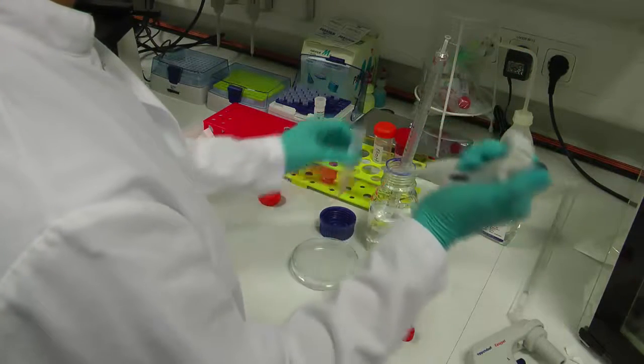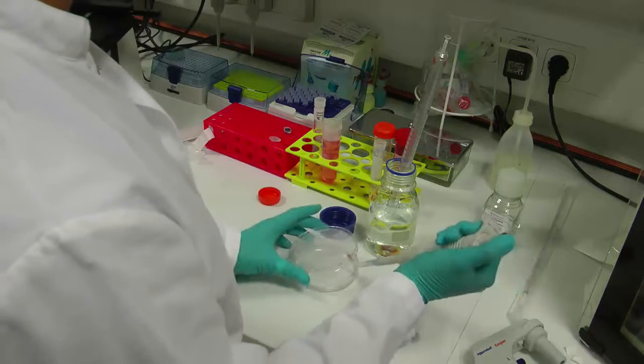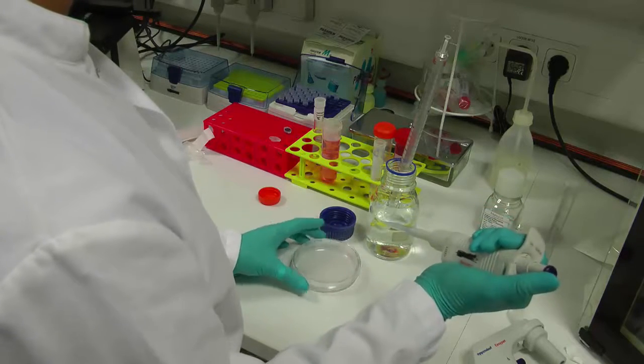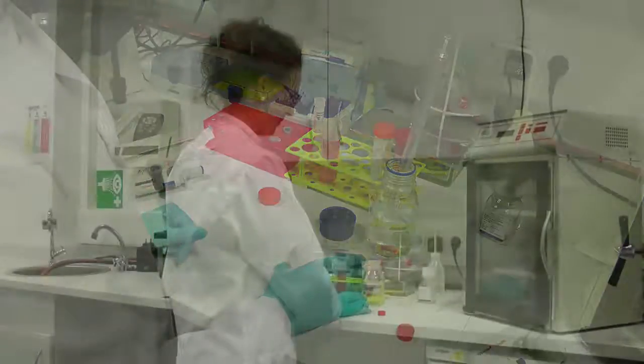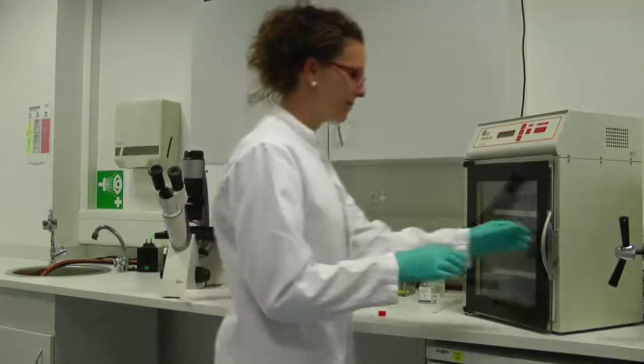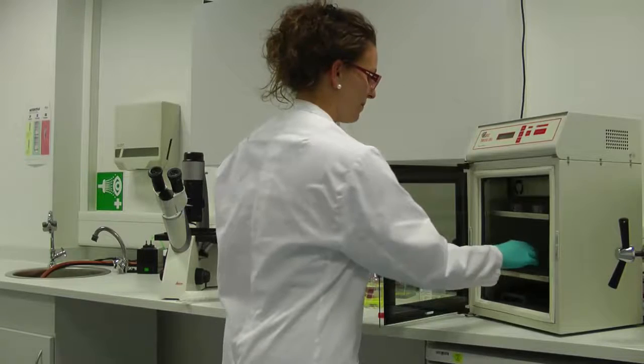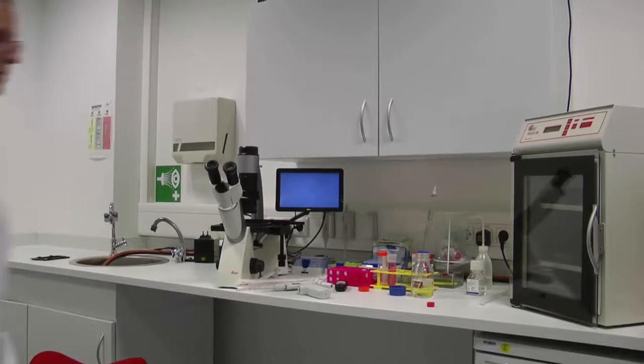Add 3 ml pre-warmed trypsin EDTA and swirl gently to cover all cells at the bottom of the dish. Trypsin in combination with EDTA causes cells to detach from the growth surface. Incubate cells for a few minutes at 37 degrees to detach them.